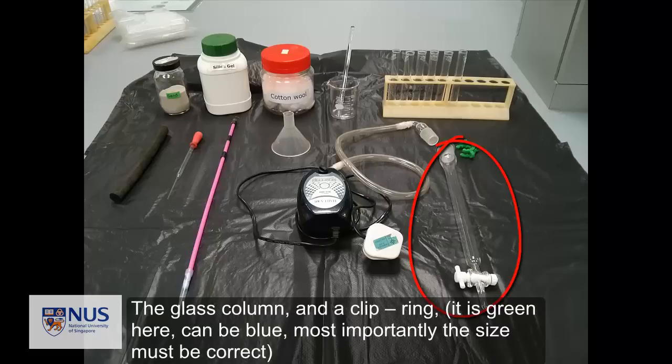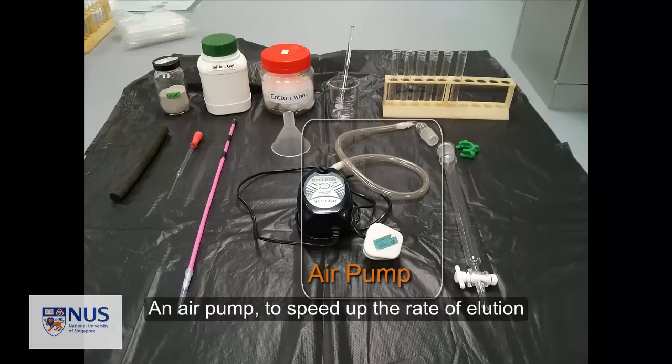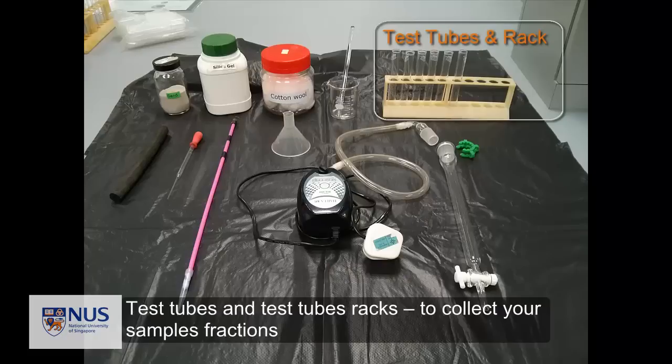The glass column and a clip ring—it is green here, it can also be blue, but most importantly the size must be correct. An air pump to speed up the rate of elution. Test tubes and test tube racks to collect your sample fractions.